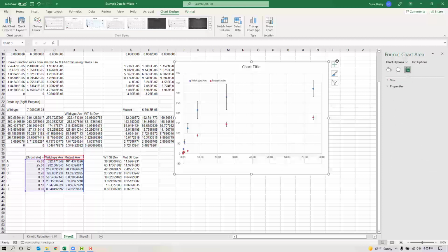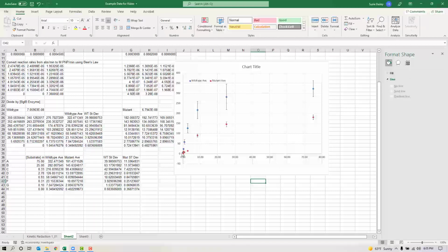And we are finished graphing the data, right? So we have our wild type Michaelis-Menten curve. We have our mutant Michaelis-Menten curve. And now by visual inspection, we can estimate where we feel like that data is plateauing. What does it look like? It kind of looks like it's trending towards a plateau here. We can estimate that Vmax value, which is where we estimate that plateau to be. Find that 1/2 of Vmax y-axis value, and if we imagine a smooth curve connecting our data points, find the intersection point for our substrate concentration, which is our x-axis value, to determine that Michaelis constant, right? And then interpret those appropriately.